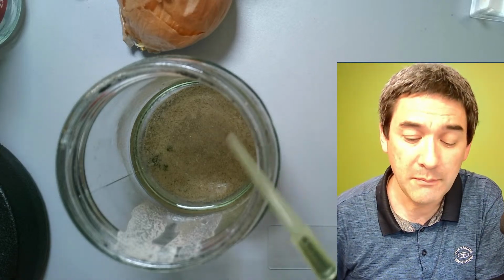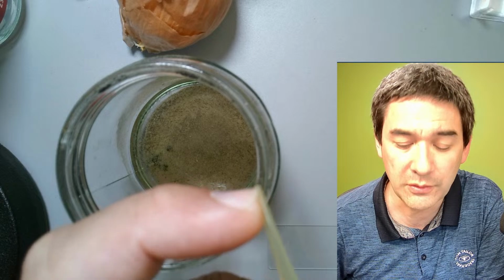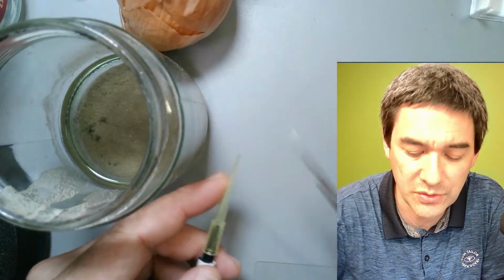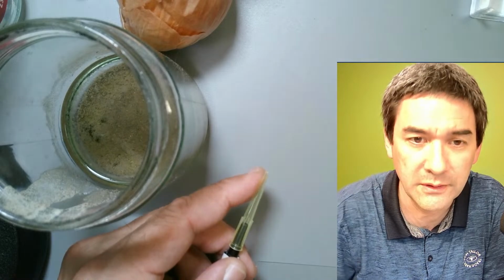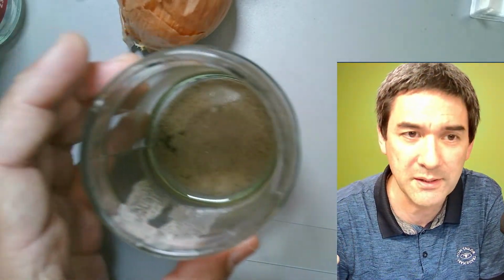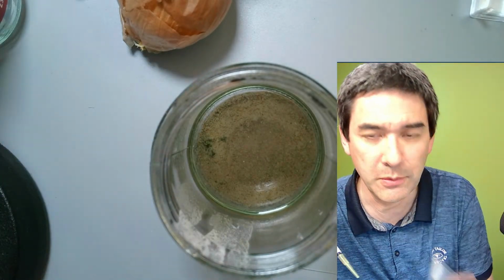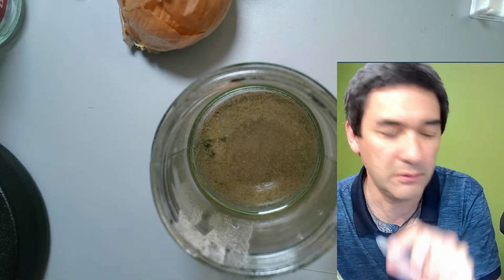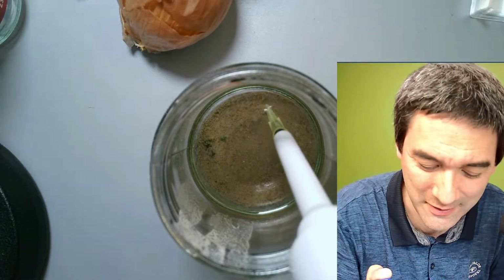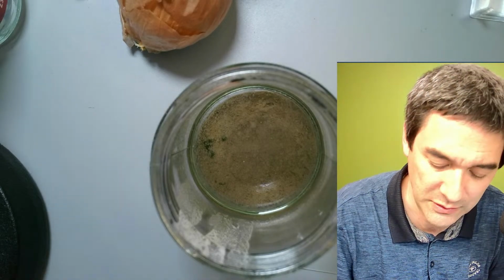Because the tip here is too narrow, I usually use scissors to cut off the tip so that I can also pick up larger samples. You can, of course, also use disposable pipettes, but these are really nice and cool to use, so I kind of like it. You don't need a lot.